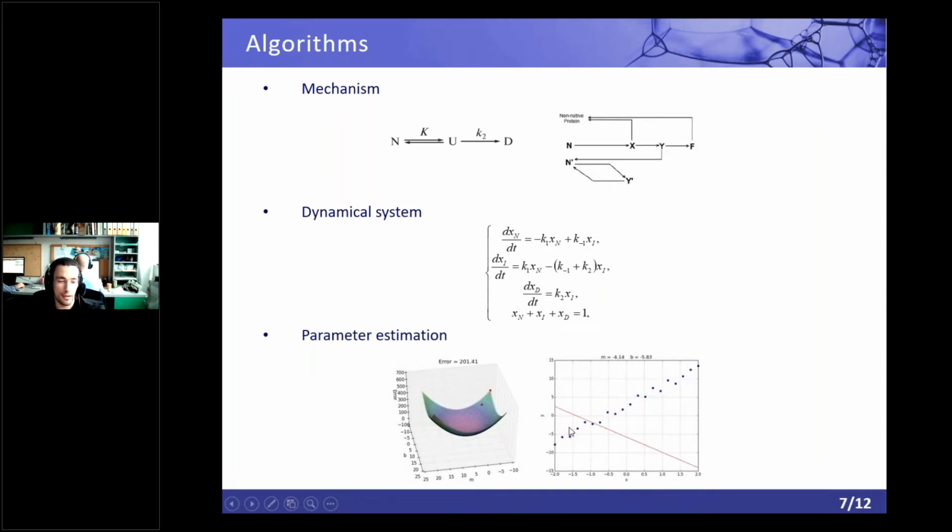I guess many of you are familiar with curve fitting. For a different set of parameters, you generate some line. Here it's a straight line, for instance, that I took from the internet, this red line. Then you have your real data, the blue data points, and you try to draw this line through the cloud of data points. Typically you have some error that is then minimized, and by doing so, you select the optimal parameters that eventually fit all your data sets.